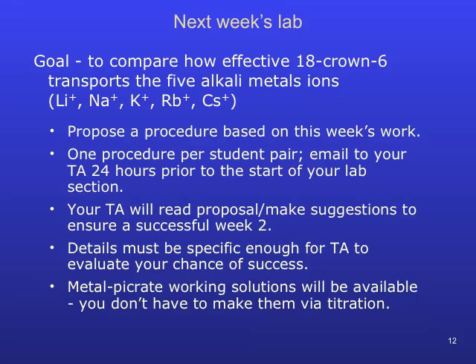Your TA may make suggestions to change your procedure, which must be done prior to starting the second week of this lab. All of the metal picrate solutions will be prepared for you, so you will not have to prepare them by titration. You will keep your working sodium picrate solution so it will be available the second week if needed.